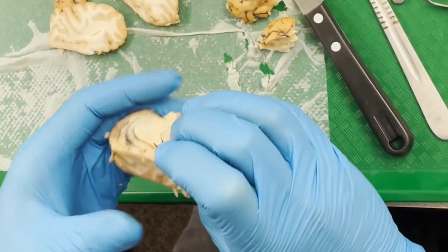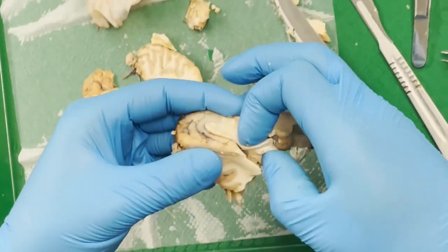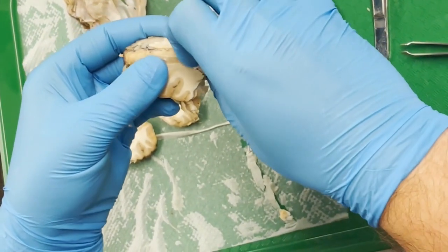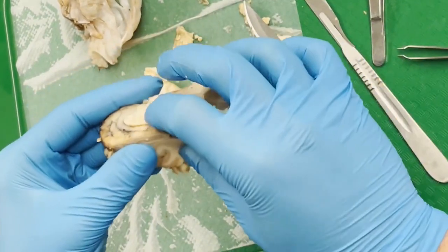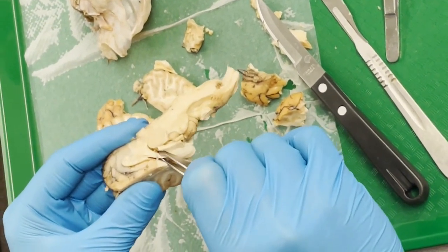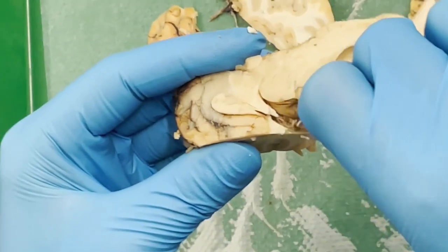Okay, so now we can start to try to peel this off from the corpus callosum. So I'm gonna take the dorsal part, pinch into the corpus callosum here just to sever it, and start to peel the hippocampus away from the rest of it. I think I need to actually grip this and pinch it and peel it out a little bit more. So let me just make sure I'm not doing this incorrectly. There we go.